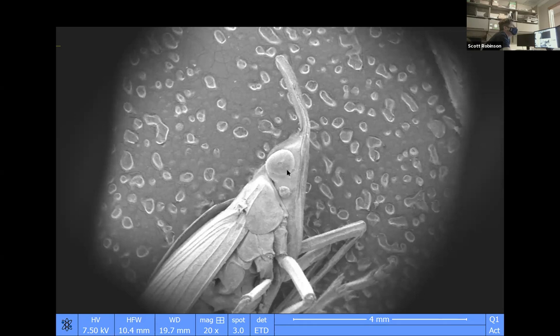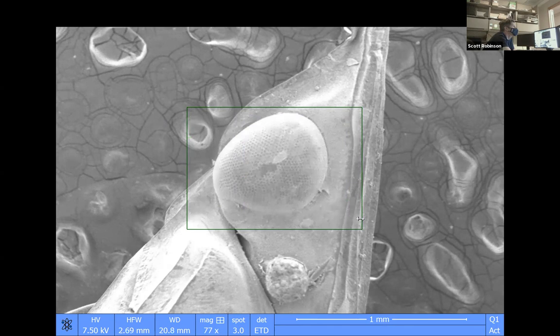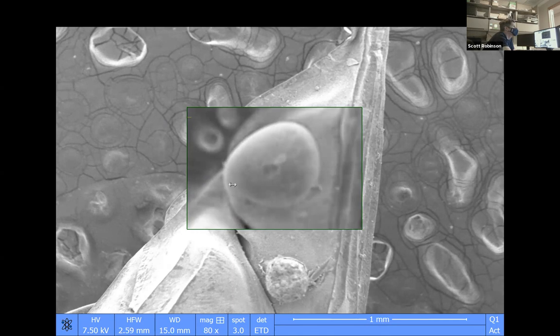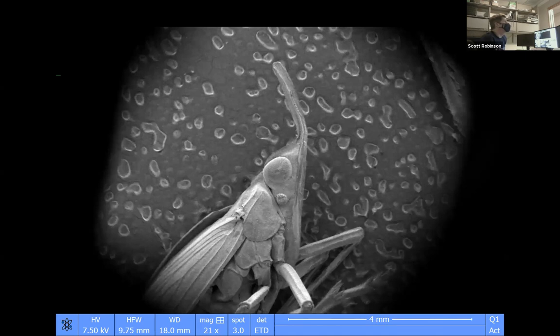Okay. One of the hoppers. Interesting. I'm not familiar enough with my hoppers to remember what group it is, and I don't want to give the wrong answer. But some of them have these crazy looking horns. So this has the crazy looking horns, and when you first look at it, it looks like a weevil, except that weevils have these pieces that come out on either side of the snout, and this one just has a kind of snout.